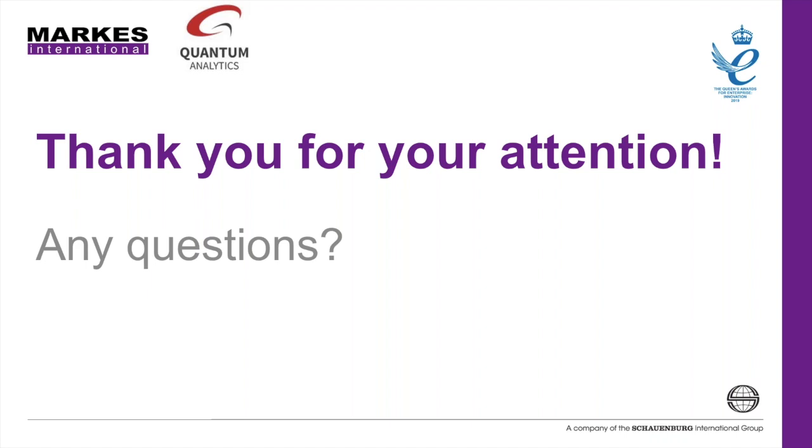Very interesting. All right. That looks like it is. Oh, I've got one more question, and then we'll call it done. If you load internal standard prior to splitting for recollection, will no adjustment be needed to account for the split?